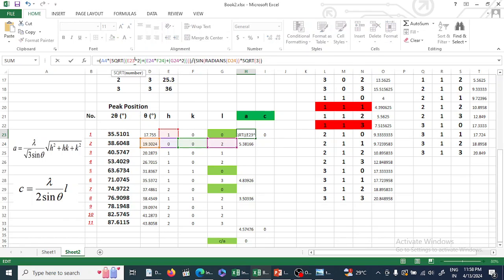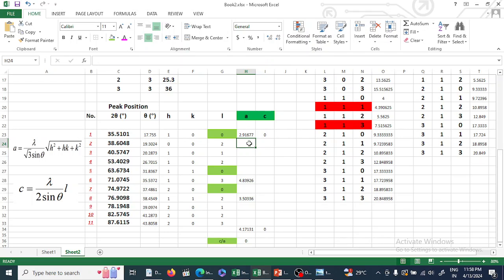E23, correct? Yes. You please carefully change these values. A lot of mistakes can happen. See, this procedure is looking like this, but this is what originally happened. Originally this thing happened. It means this one gives you the exact concept.